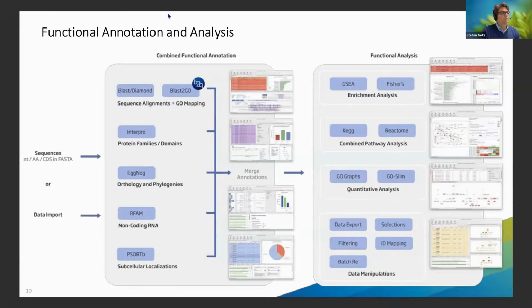one annotation set. This is super useful if you have a novel or newly characterized genome or transcriptome, because you can automatically annotate and manually curate your annotations with a high level of transparency.